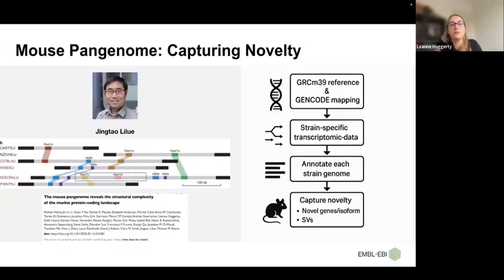I wouldn't say that assembly is a fully solved problem, but there are these Galaxy pipelines that people can pick up and use. I think that doesn't really help if the person is asking here what technologies they should spend their very valuable funding on. But perhaps having a look at those Sanger pipelines would give you an indicator of what you should be focusing on there.